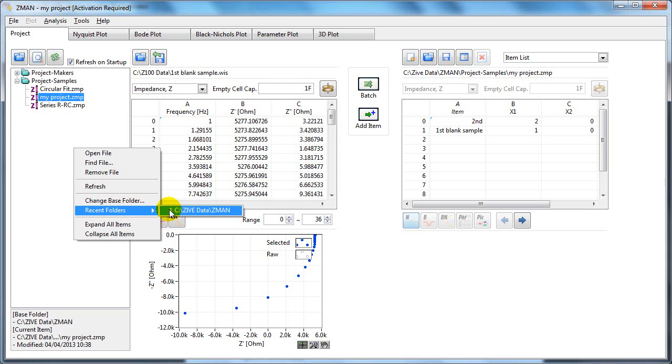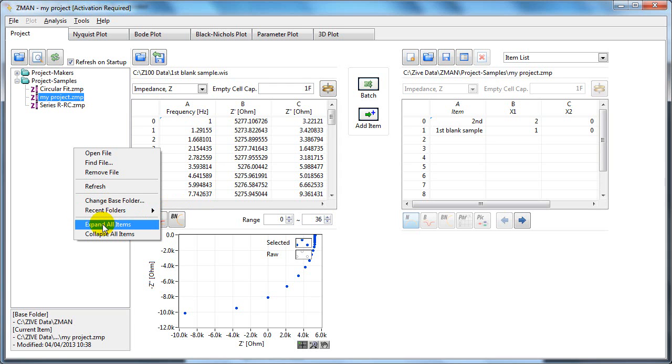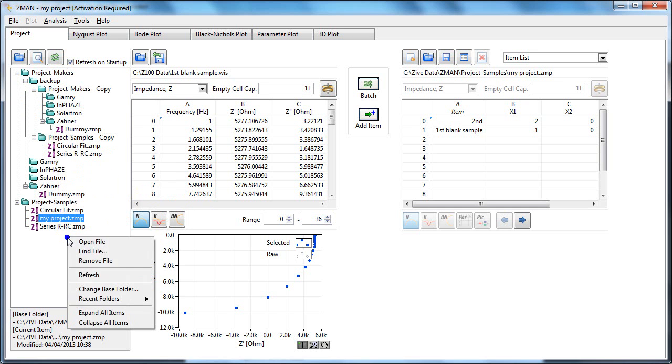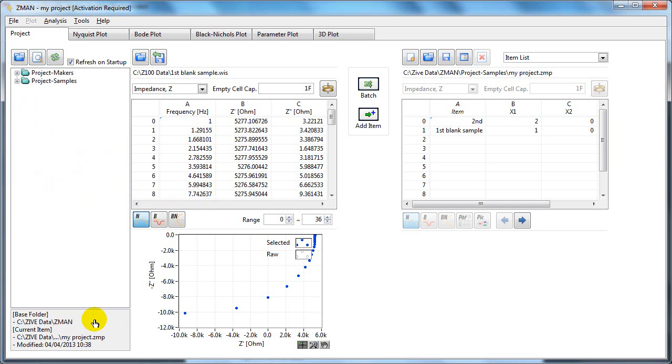There's a list of recent folders here. And you can also expand all of the items here or collapse all of the items.